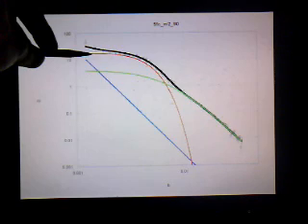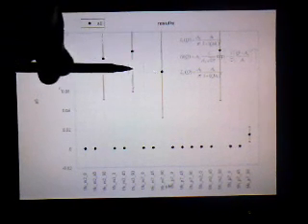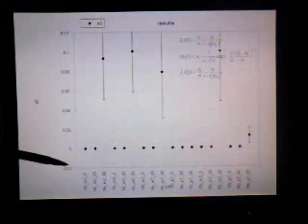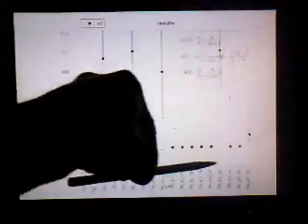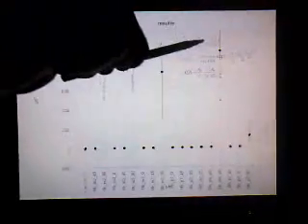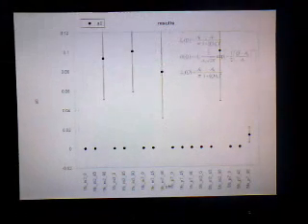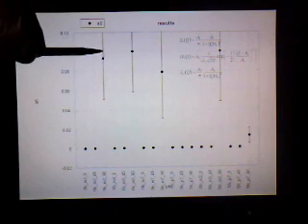So onwards. Now, what I'm going to show you very quickly, because these talks can only be 10 minutes long, will be a plot of the parameters. Each of these parameters is a function of those different field conditions. In this case, I'm plotting the amplitude of that spike, and you only see a non-zero value of that spike at the condition of Q perpendicular to the applied field, so 90 degrees.